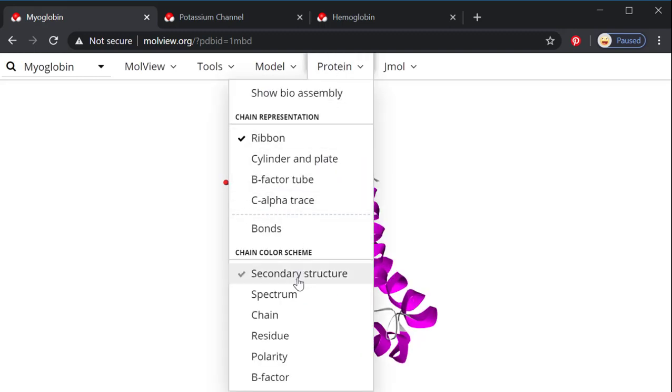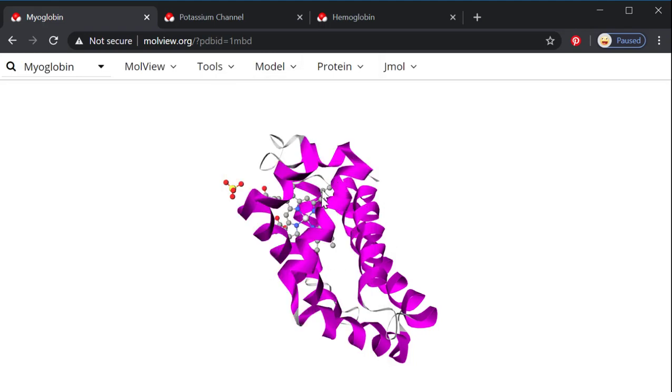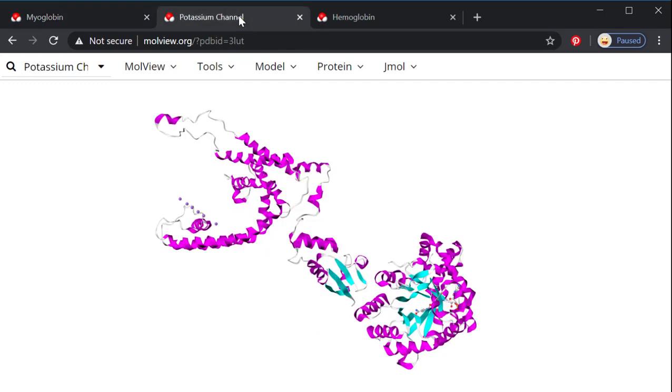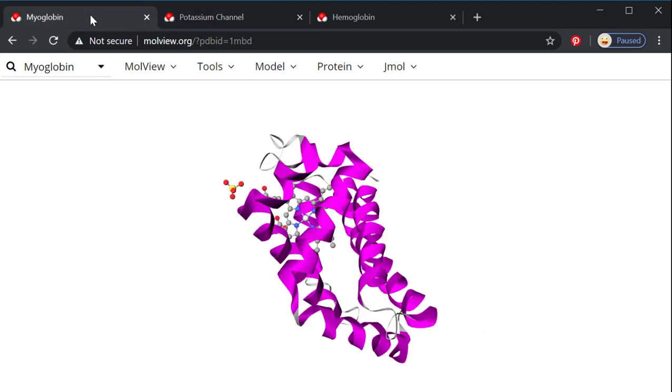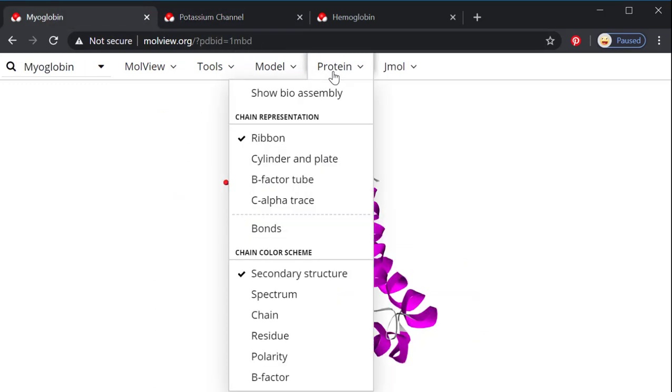And right now we're looking at secondary structure. So in this protein, all we have is alpha helices, which are purple. But if I look at a potassium channel instead, you can see that there's purple alpha helices and then these blue flat ribbons, those are the beta sheets or the beta pleated sheets.